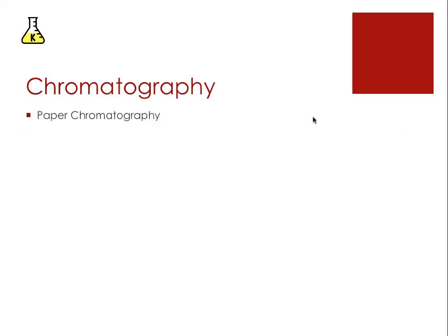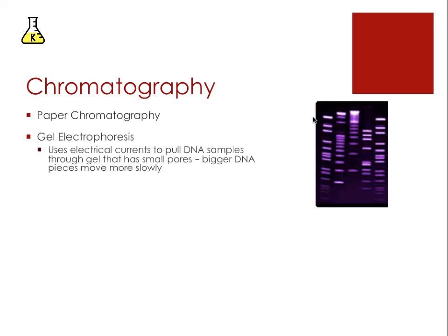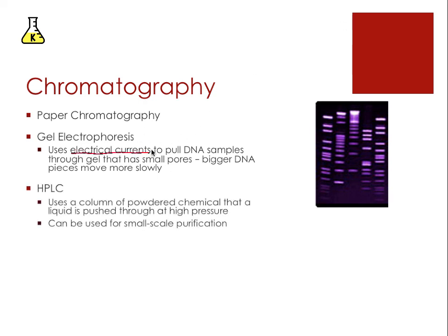Chromatography comes in a lot of different flavors and varieties, as we already mentioned. We already saw a quick demonstration of a very simple method, often used in classrooms to demonstrate this, known as paper chromatography. Something you probably saw back in freshman year is gel electrophoresis. It's a very simple methodology with the same basic principles. Instead of using a mobile phase that's attracted via capillary action, gel electrophoresis uses electrical currents to pull charged DNA samples through the gel.